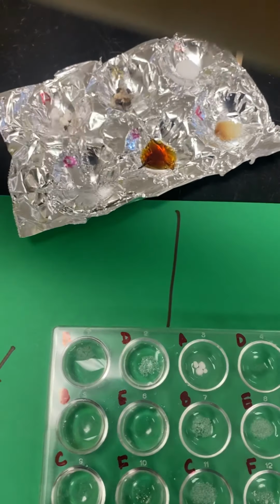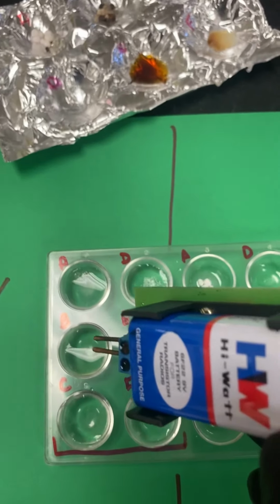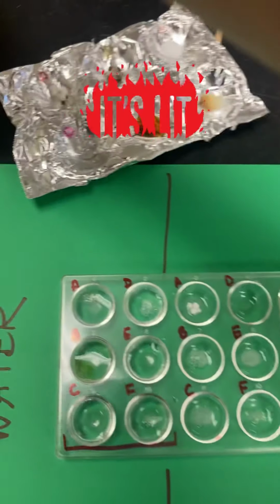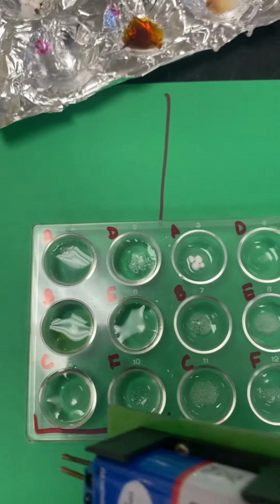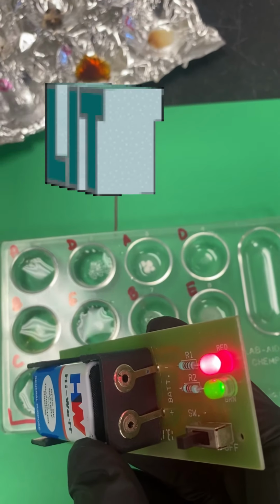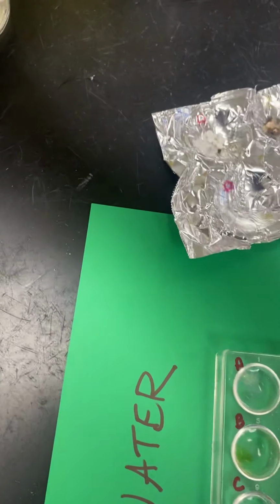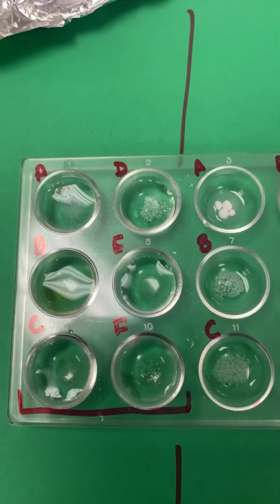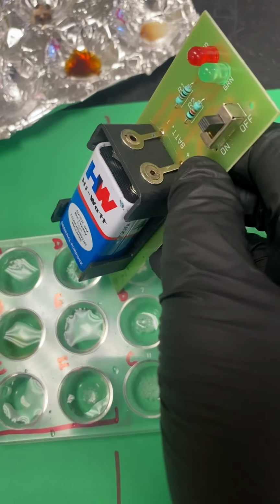Don't want to cross-contaminate, so I'm just going to clean it in between. And then we're going to go to our potassium iodide. Yes. Lights up. Then to our sodium chloride. Yes, it lights up. Come over to aspirin. Nope. Does not light up.